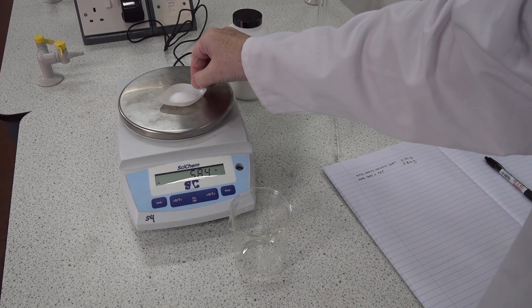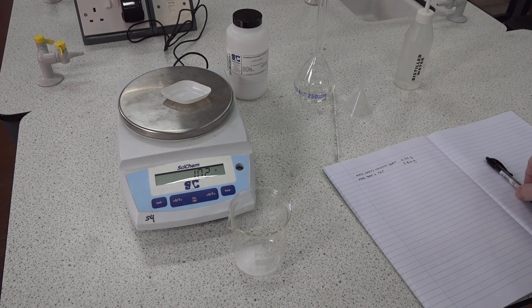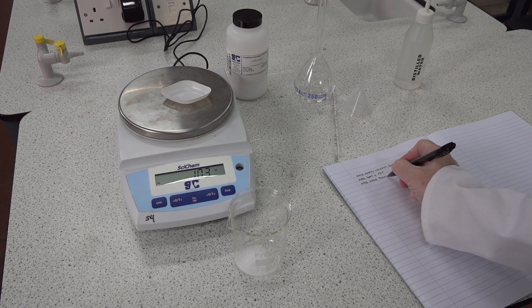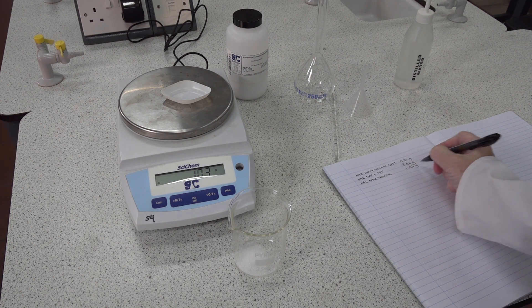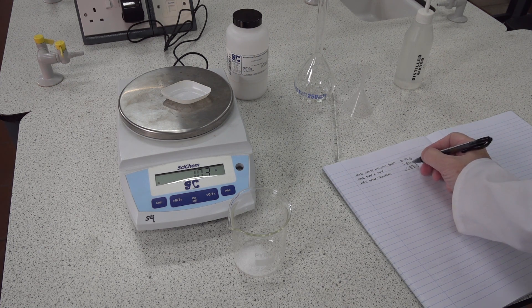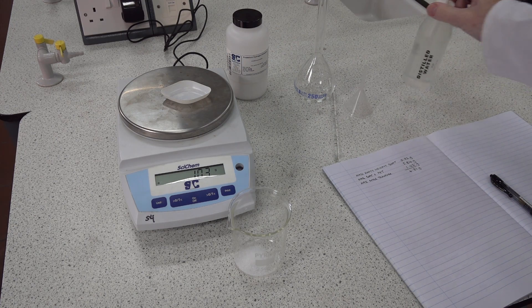We would then transfer the salt to a 250 ml beaker and reweigh the boat to see if any was remaining. Mass after transfer: 1.03 grams. Thus by subtraction of the last mass from the previous mass, we can determine how much potassium hydrogen phthalate is actually in the beaker. In this case we've got 4.81 grams, and we're just within the criteria of the practical: 4.8 to 5.4.